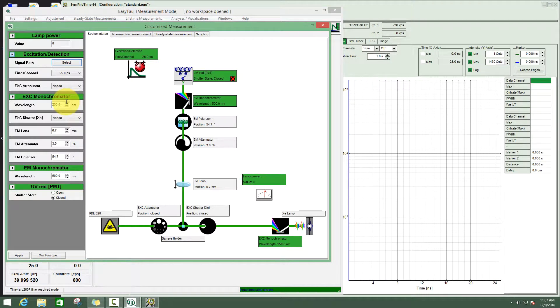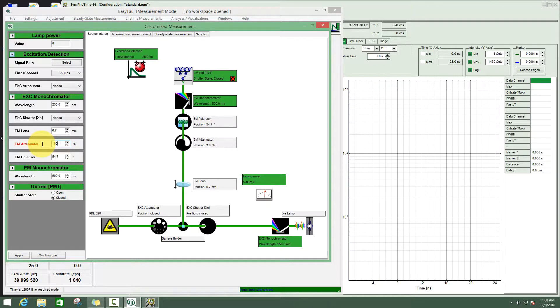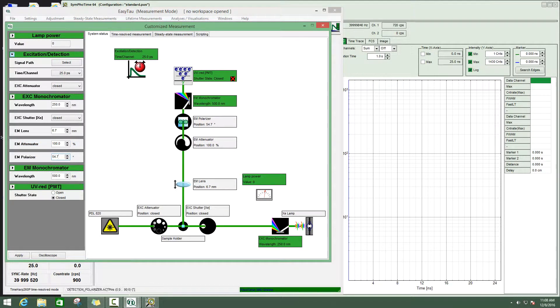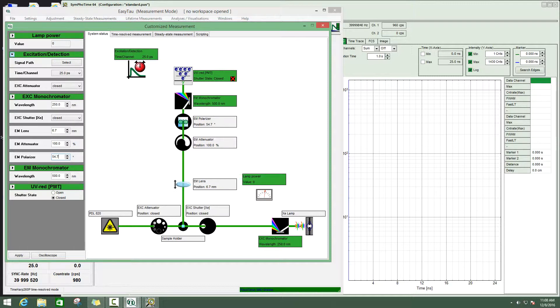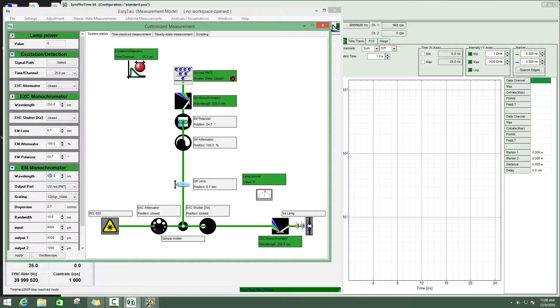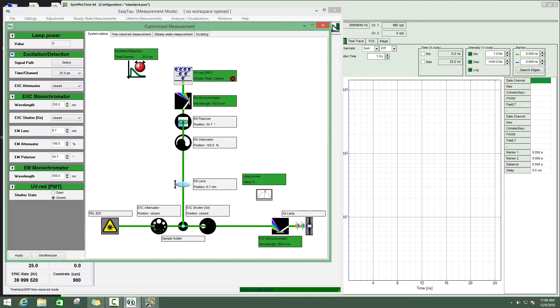Then go to the detection element. The emission attenuator I will put to 100%. The emission polarizer position does not matter. It is important that it is physically out of the beam path because the polarization information is lost in the multimode fiber. The only thing the polarizer would do would attenuate the detection light. We have to remove it physically in the FluTime. The emission monochromator I set to the right detection wavelength. Let's set it to 550 nanometers. I open the slit completely for the measurement and then I open the shutter.